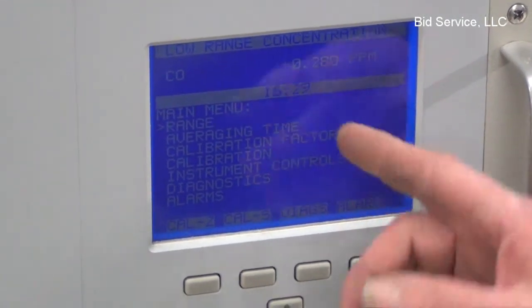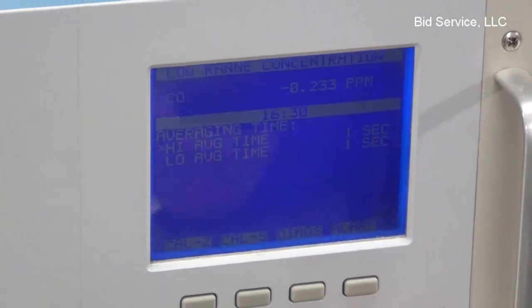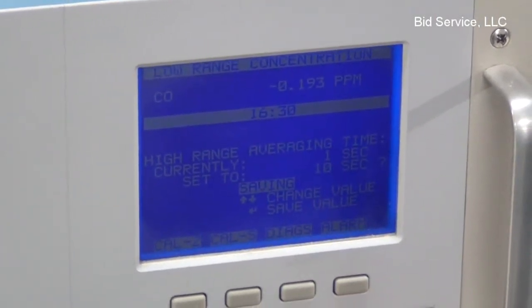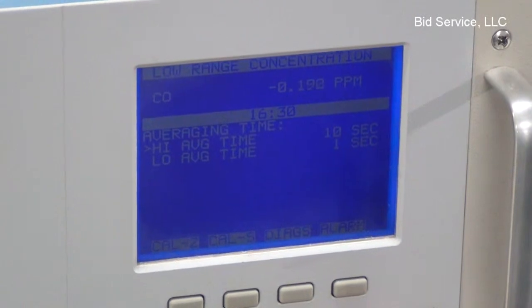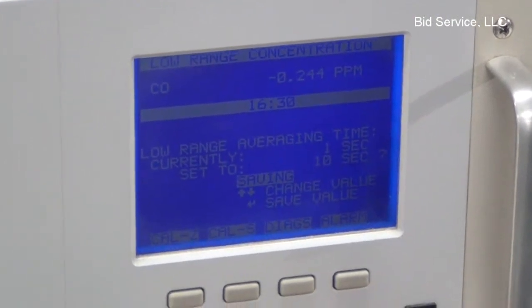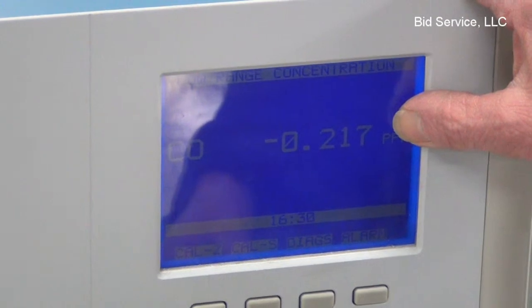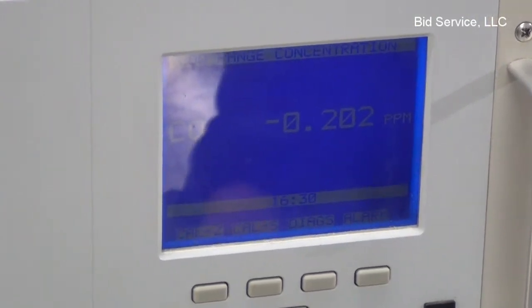For example, if you wanted to change the sample rate or averaging time — let's say it's too fast and you'd like to sample it at, let's say, 10 seconds — the sample rate would then be displayed at 10 seconds, or any other rate that you'd like to have put into place.